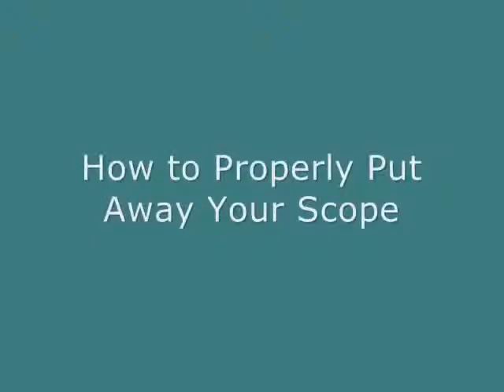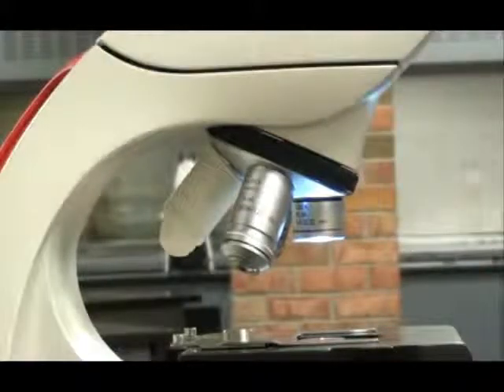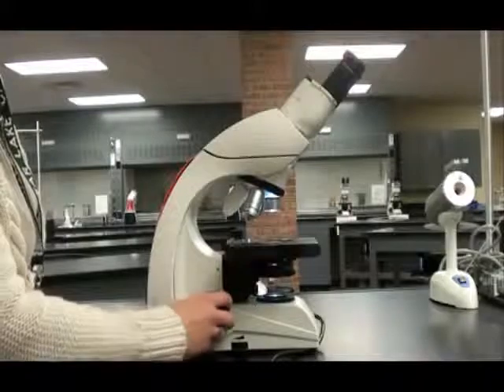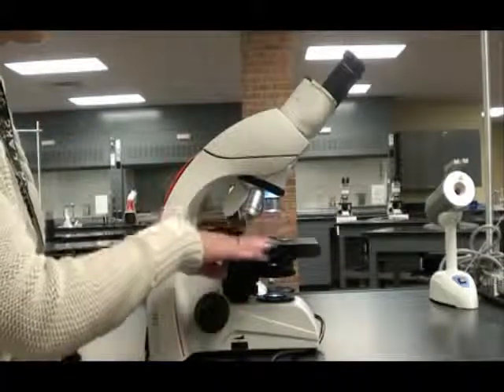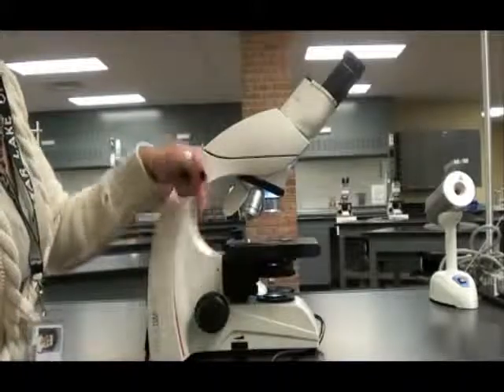When you're all done, it's important to put away your scope properly so it won't get damaged. Do this by making sure that the shortest objective lens — the scanning power — is pointing down. Then dial the coarse focus down all the way to lower the stage as far as it can go. This ensures the lens is not going to smash into the stage.